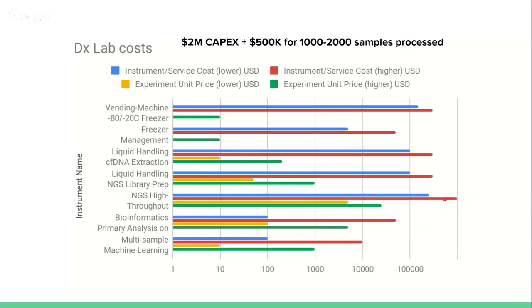The ugliest part here is the sequencer. If you buy an Illumina NovaSeq sequencer, you're going to have to pay close to $1 million. There are going to be service charges every year, and on top of that, you're going to have to buy reagents to use in each of your sequencing runs. Other offerings from PacBio, maybe $500,000 or so. Other offerings from Oxford Nanopore, much cheaper, to the point where the machine comes for free if you buy enough flow cells, enough reagents to do enough runs.